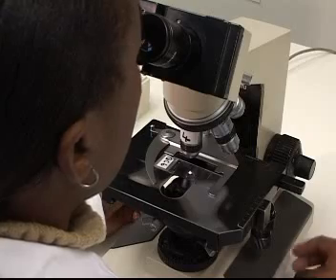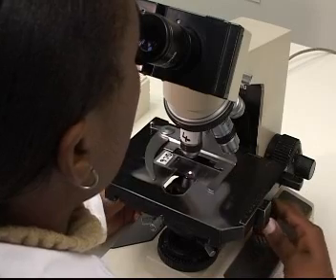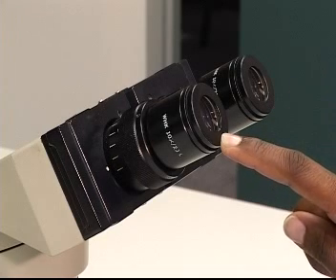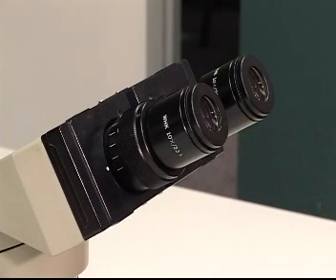Now, look into the microscope with your eye about 2 centimeters away from the eyepiece and slowly lower the stage using the coarse adjustment until the image comes into view. This part here is the eyepiece. You will see that the eyepiece has a label saying 10 times, which tells us that the eyepiece has a magnification power of 10 times, or it magnifies the object 10 times.